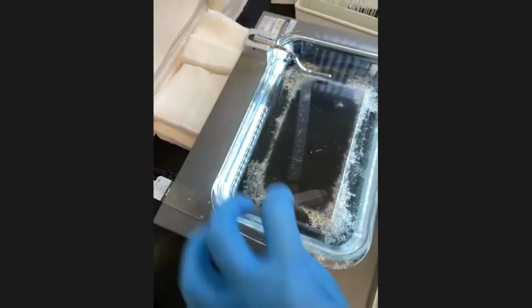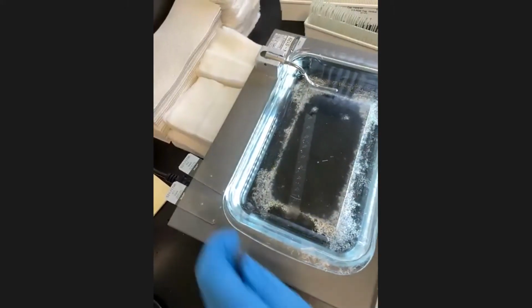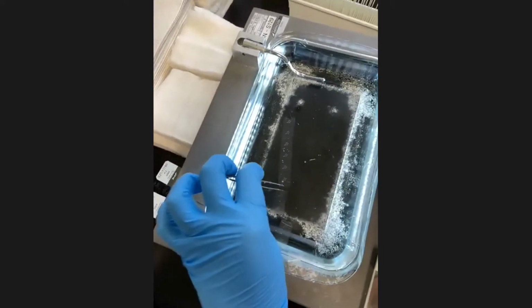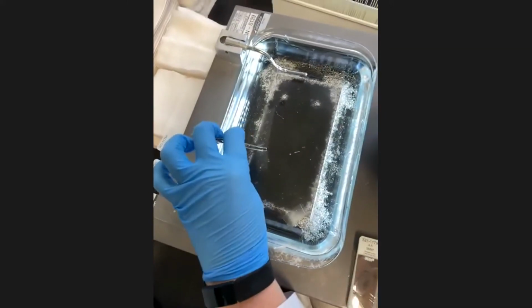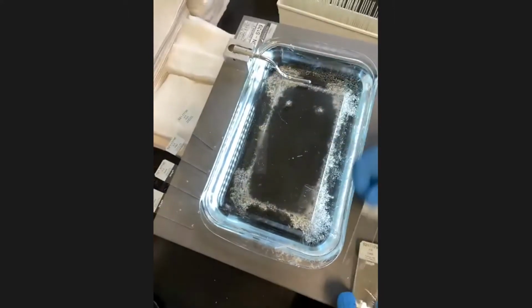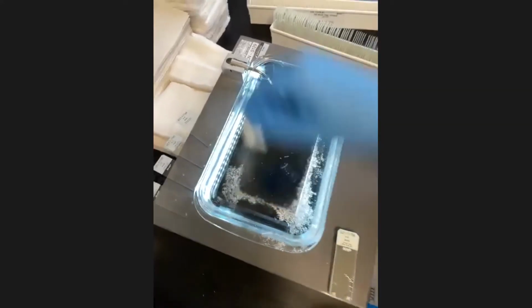And we just go down the line and put them on the slide in the order that they're cut. Sometimes we get wrinkles in a few of them, so we'll skip over the bad ones. And we just go all the way down the line until we get all of the slides in our panel, which is anywhere from 13 to 15 slides, give or take. Just like that.